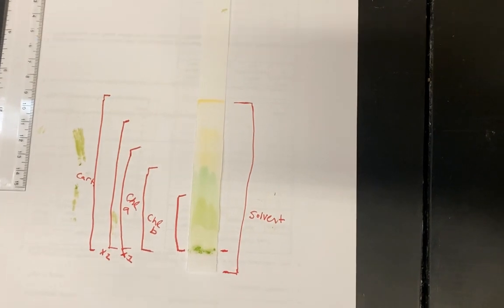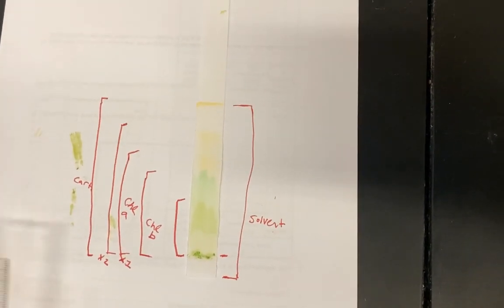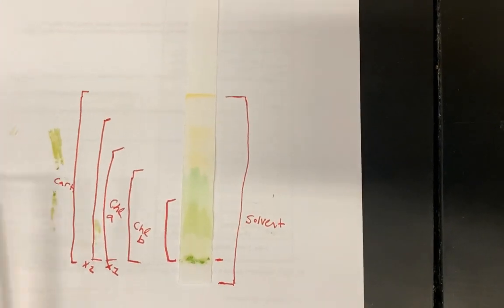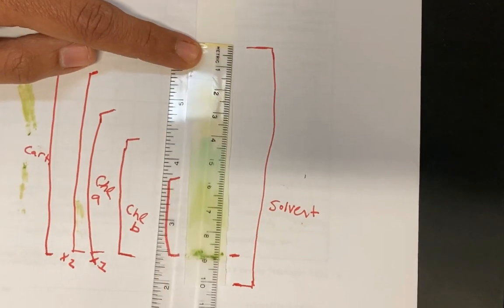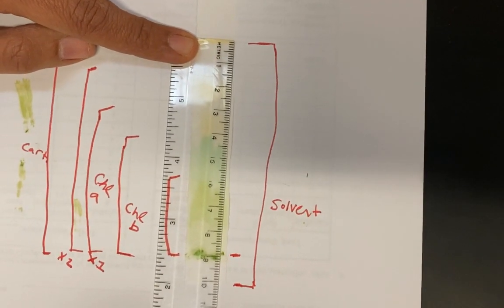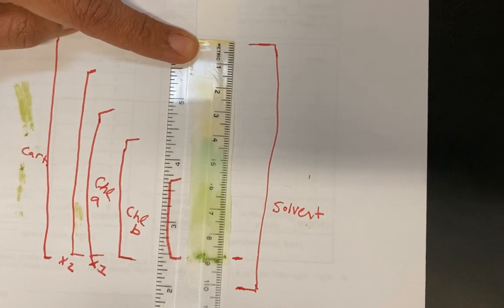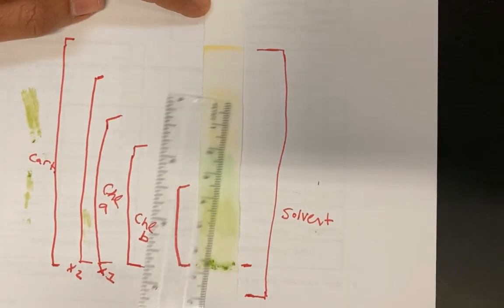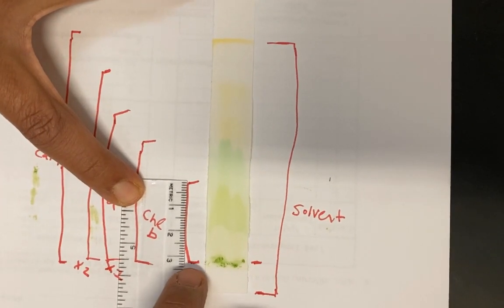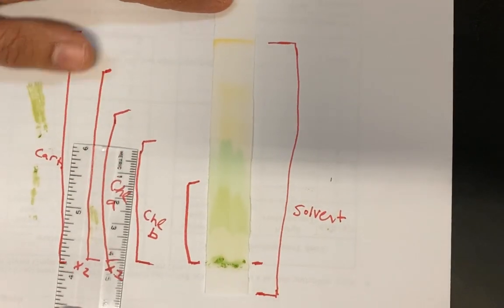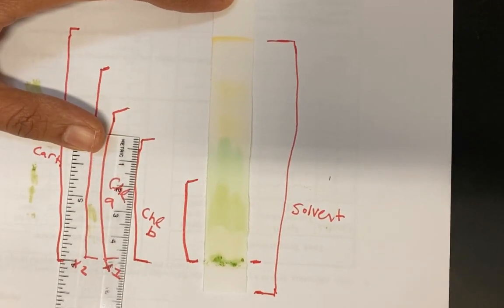Okay, so now what I'm going to do is I'm going to use the ruler to measure all these distances. And you're going to have to put this in your lab, right? So you're going to have your measurement for the solvent line. Okay, so you can see about how much that is. And then you have your measurement for your chlorophyll B. And so again, remember, it doesn't go down to the bottom of the paper. It goes up to here.